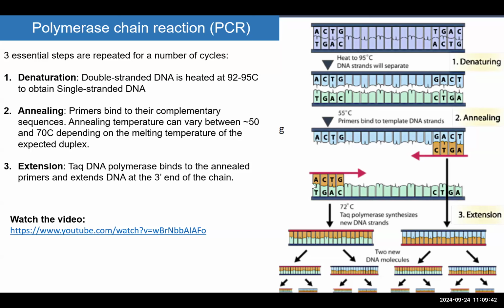So this primer is already bound and this primer is already bound. And then the Taq polymerase is going to come and complete the fragment synthesis on both sides. And then you get 2 copies. And you repeat this again and again and again. Think about it: every round of PCR, you start, imagine, from 1 molecule, and you already end up with 2. Then each of those molecules is going to become 2. So this is an exponential procedure generating tons of these specific DNA fragments.